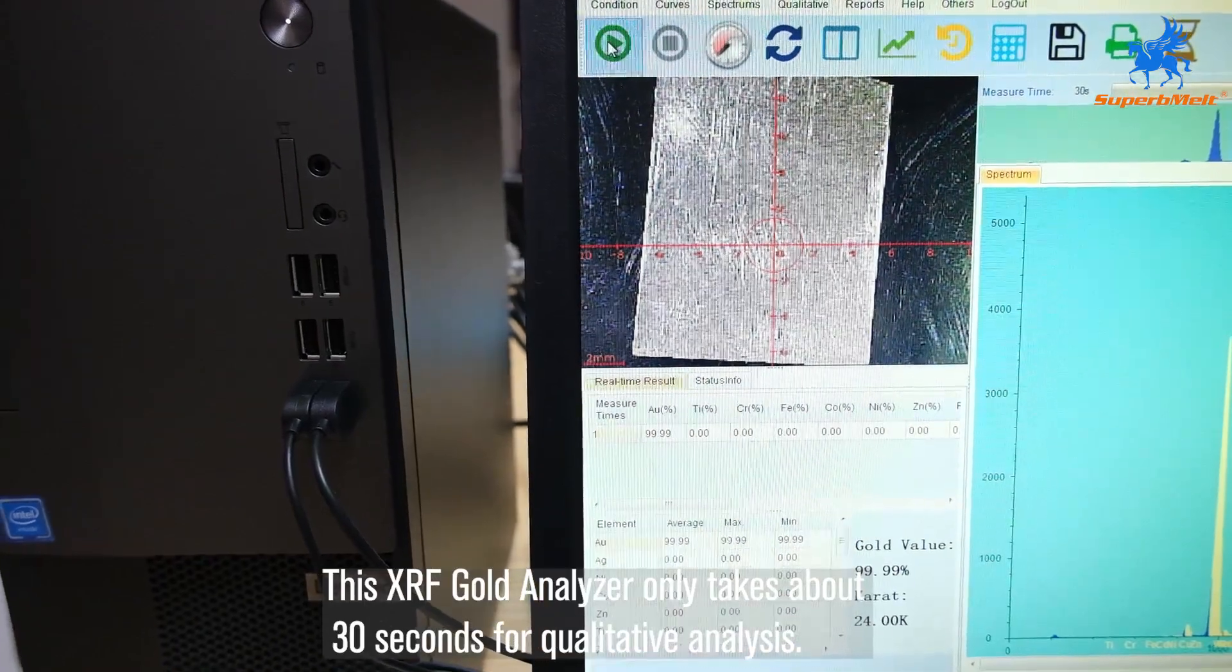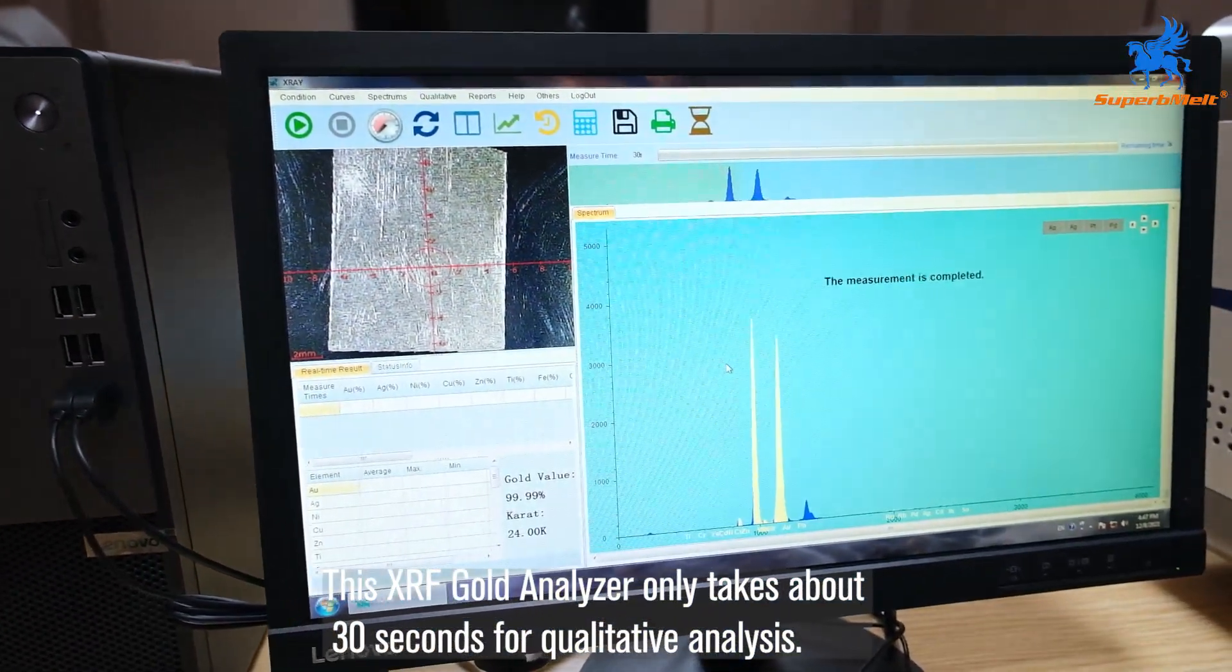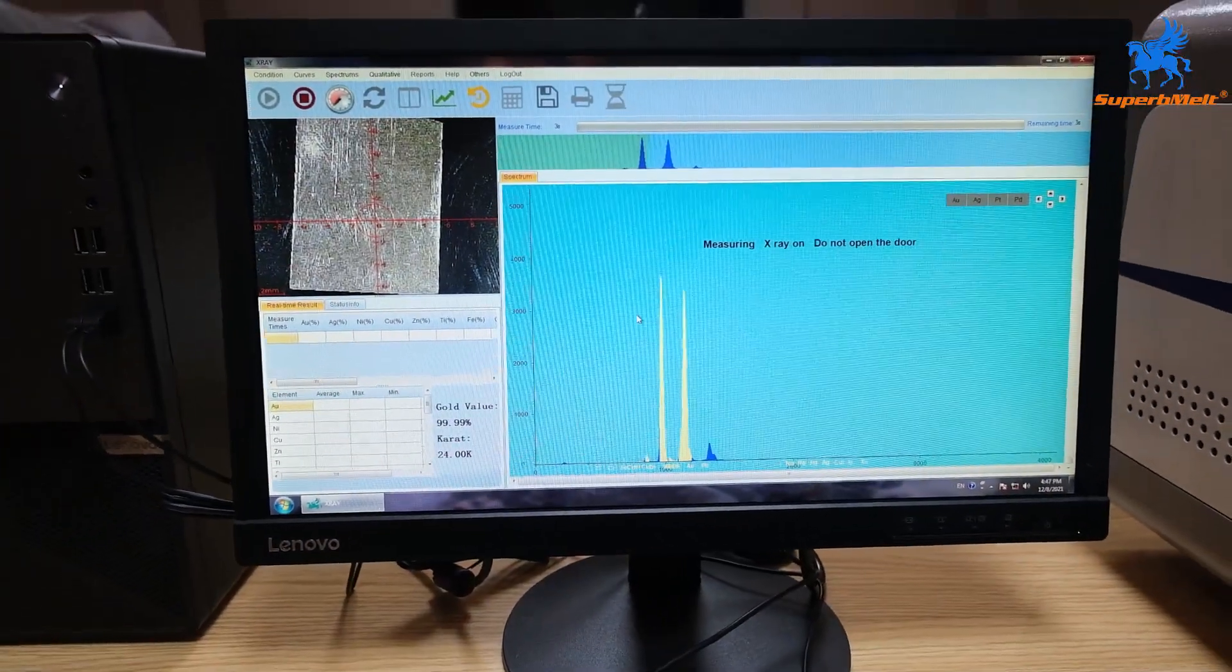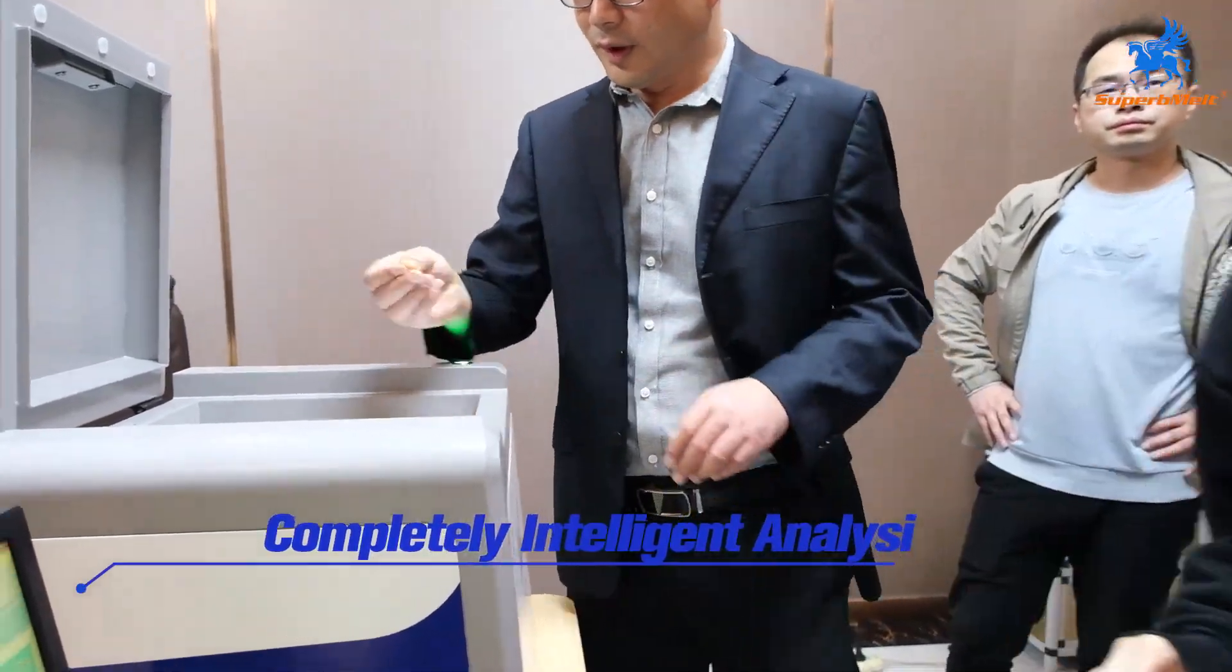This XRF Gold Analyzer only takes about 30 seconds for qualitative analysis. There are following advantages. Completely intelligent analysis.